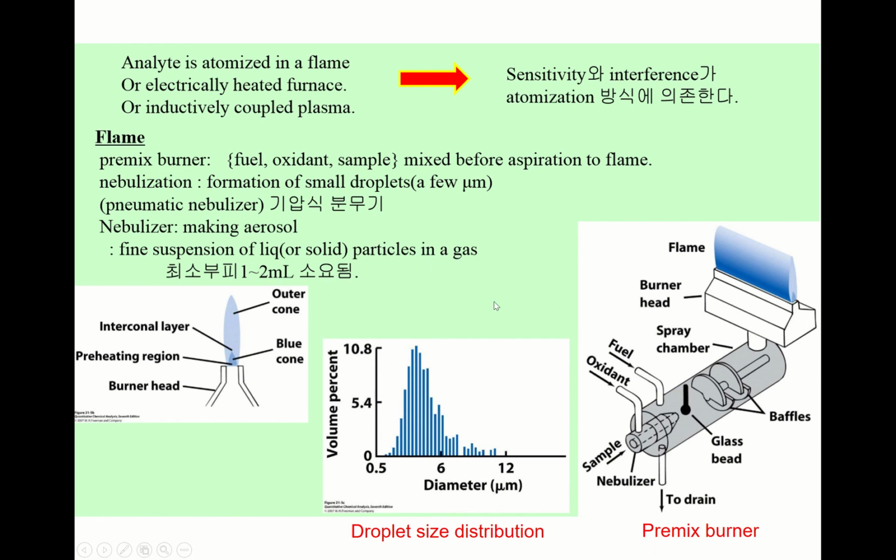Okay? So to operate this instrument, you need at least 1 to 2 milliliters of this amount of sample. You may think this is a very small amount, but actually sometimes this is too big. And then you'll see how much smaller amount can be used.